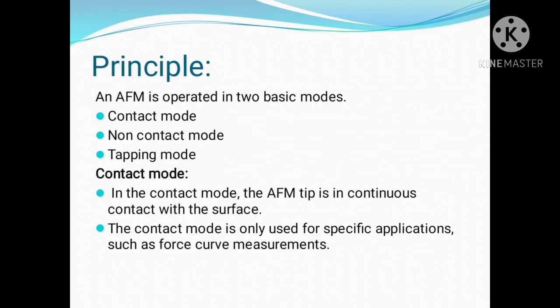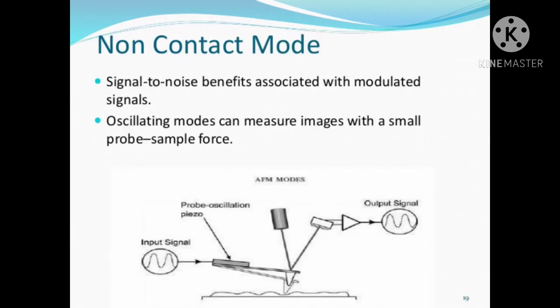There are mainly three basic modes: contact mode, non-contact mode, and tapping mode. First of all, contact mode. In the contact mode, the AFM tip is in continuous contact with the surface. The contact mode is only used for specific applications such as force curve measurements.